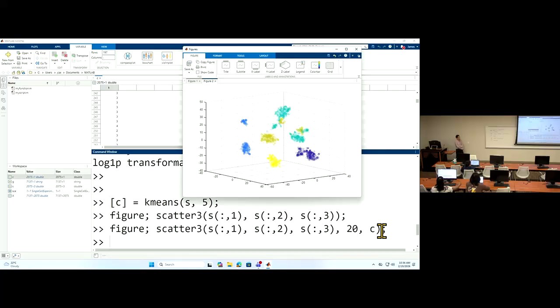So now you can play with this K. I just arbitrarily put a 5 here, but you can have some guess how many clusters are in there and replace this maybe with 1, 2, 3, 4, 5, 6, 7, 8, 9, maybe 9, and just see whether you have better results that fit your visual clue here.